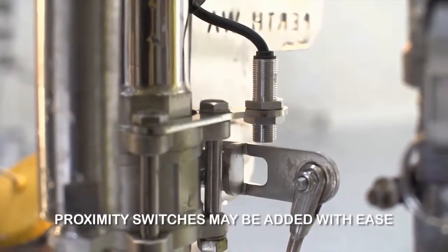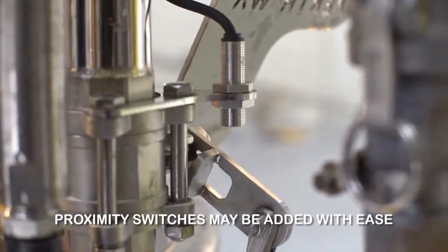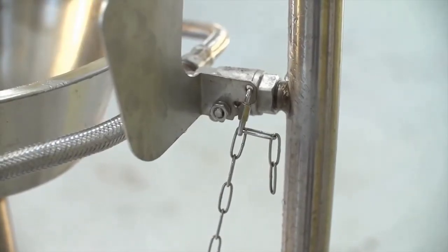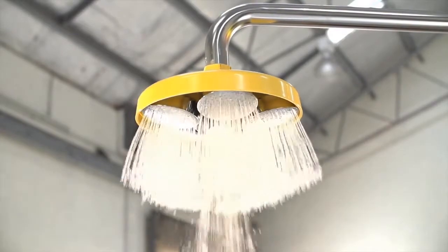As you can see, there are many crucial aspects to a safety shower that allow it to perform correctly when it's needed most. While other designs cut costs and duplicate parts to save money, Ashley's shower is engineered to do what's most important: keep your team safe.